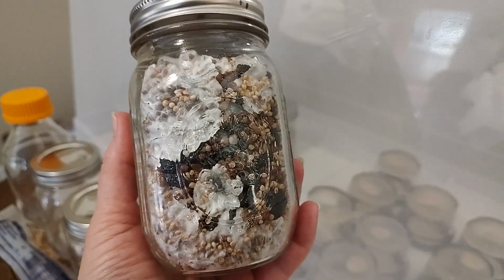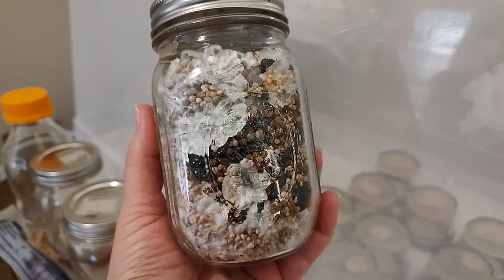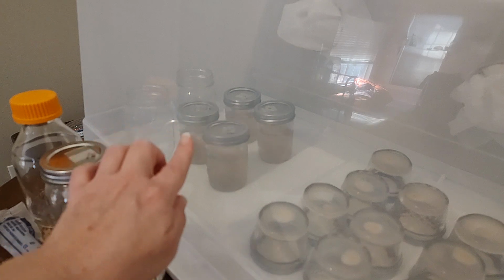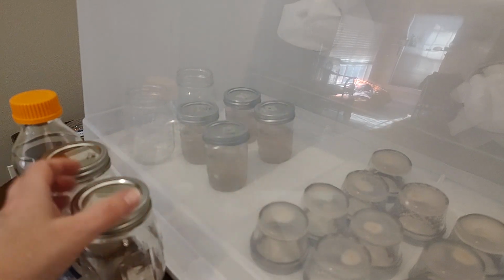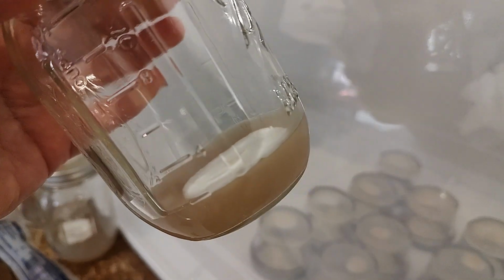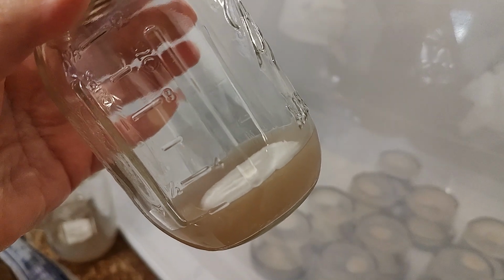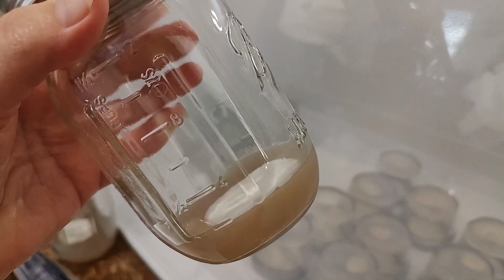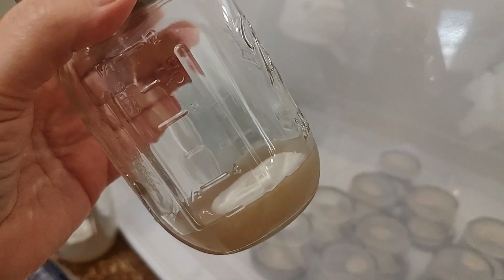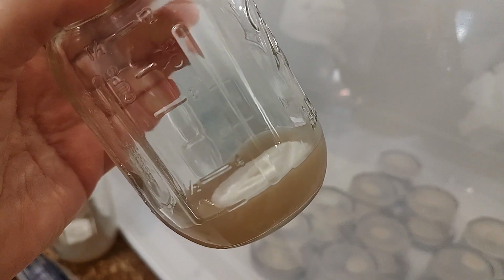And in this video, I really want to talk about spores versus liquid mycelium. Whether we're talking about LCs, which are here in the still air box, liquid cultures, or slurries, which we're creating here, it's the idea of creating liquid mycelium versus working with spores. And it's actually really easy to create liquid mycelium. And I want to share that with you.